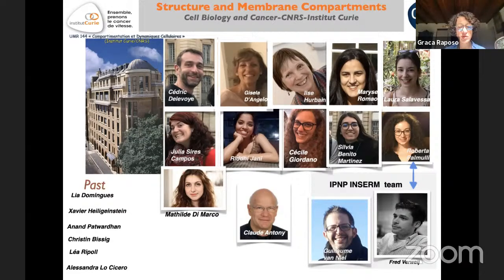One which is a more general question is, what considerations should we have before thinking about performing EM, regarding samples and experimental procedures? I think for me, what is really important is, you have your cells, you have your biological question, isn't it? This is the sense of your question. You have your biological sample.